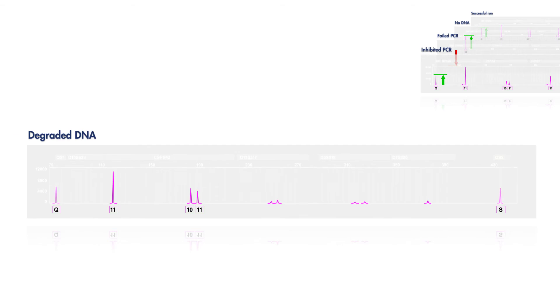Degraded samples give a different result. You'll still see the ski slope effect, but the quality sensor 2 peak will be strong. Now you know that the DNA is degraded, so diluting the sample and reamplifying would be a waste of time.